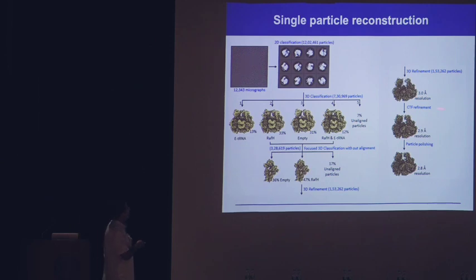And to improve our data further, we did advanced refinement, that is CTF refinement and particle polishing. Basically, initially when you get a movie stack, you align this stack based upon a small segment, small pieces of that segment.